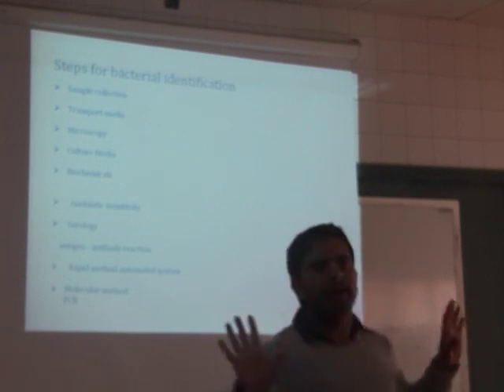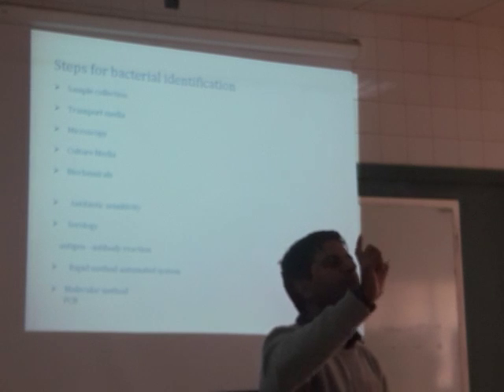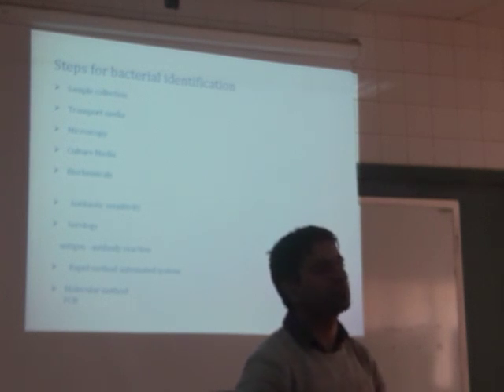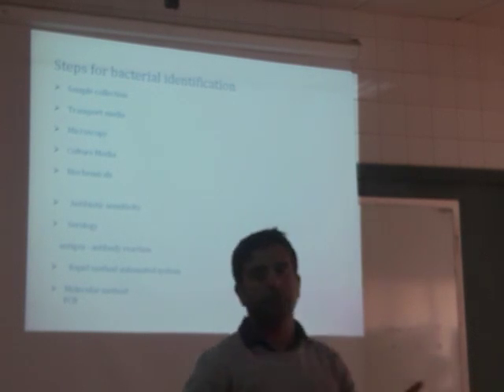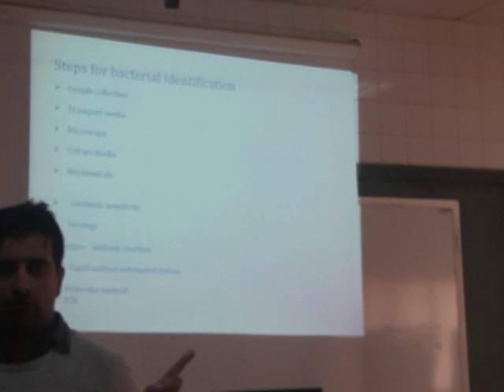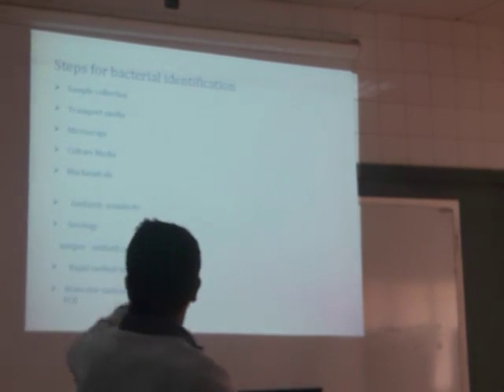If we do not need agar, at that time we keep the media in a bottle in a liquid form. It is called a liquid broth. But if we need to solidify, it is important to add the agar. Agar is not a nutritional factor. Yes, correct. It is not a nutritional factor.